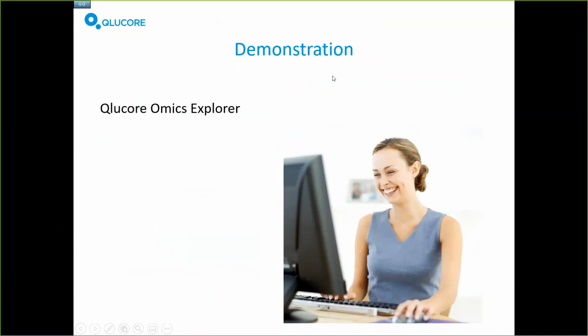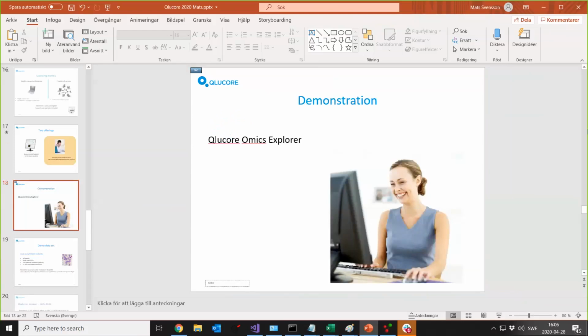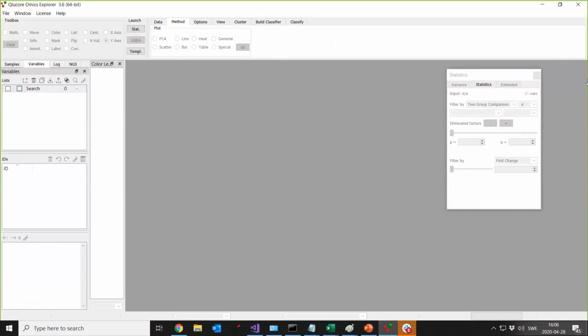So now to today's main topic, the demonstration of the software. What I'm going to show is just a few basic steps and a few basic plots that can be brought up in Omics Explorer. So what I'm going to do now is to remove some of these extra windows that I have on my screen, which hopefully aren't seen on yours.